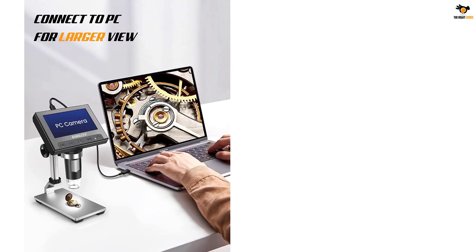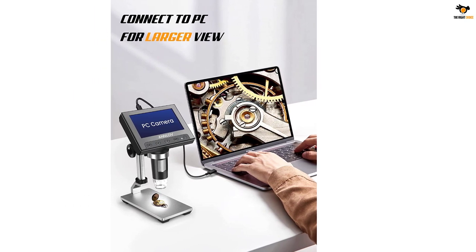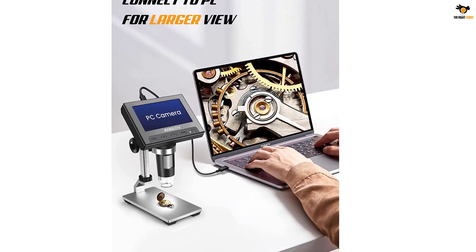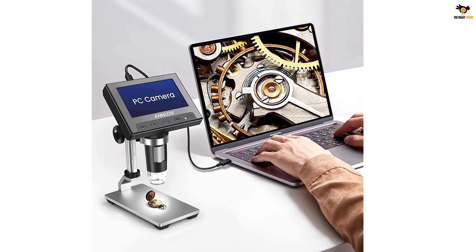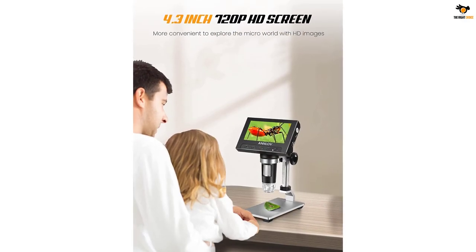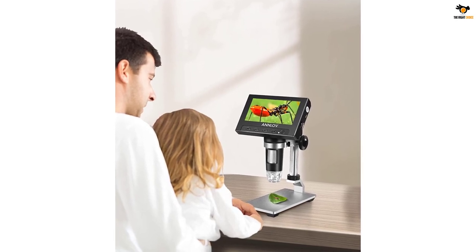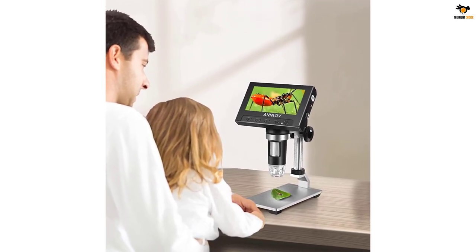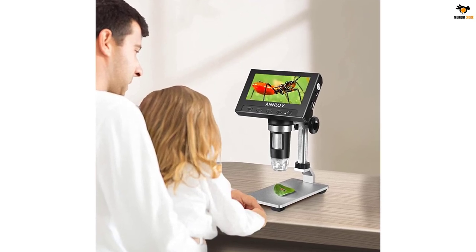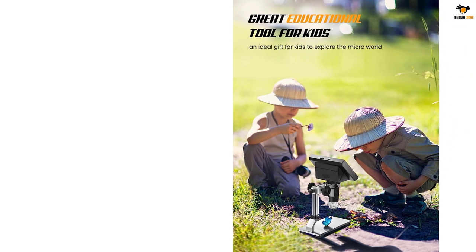It's evident that ANNLOV has put a lot of thought into the construction of this device. When it comes to convenience, this microscope doesn't disappoint. It is perfect for outdoor adventures because it's small — 8x6x3 inches — and lightweight at only 1.62 pounds. The adjustable aluminum alloy bracket is a notable improvement over the older plastic version, which has been particularly helpful when focusing on tiny objects and needing a steady hand.